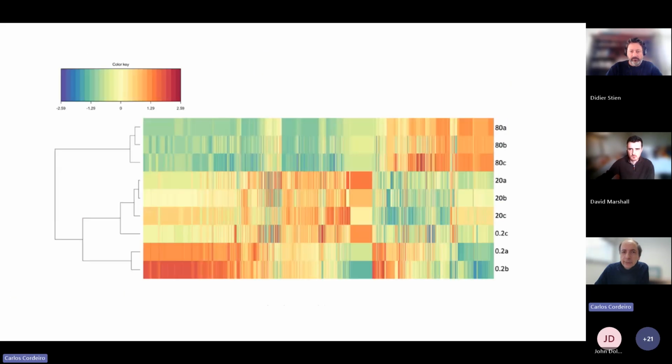And if you look at this, this would be just a comparison, a heat map showing what happens for the sets of concentration that we tested on different biological replicates. And you can clearly see that you have two distinct groups. Each of these small tiles corresponds to one annotated, identified metabolite. So there are a few thousands here. So without entering into detail, you can see that there are very, very dramatic changes in the entire metabolism of this cell.